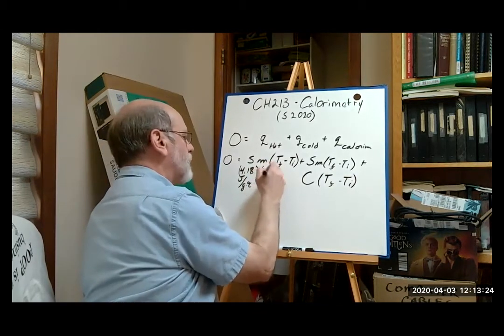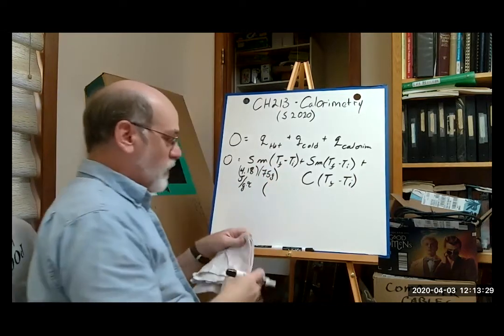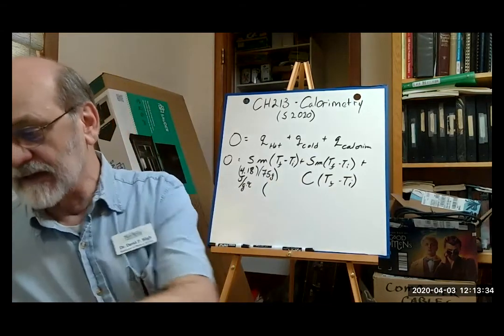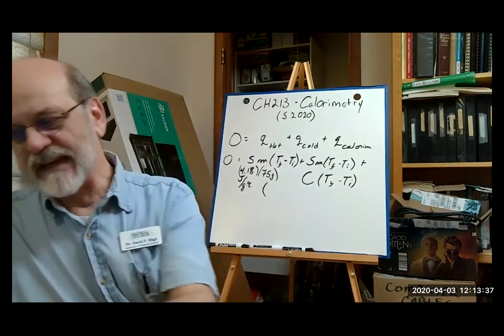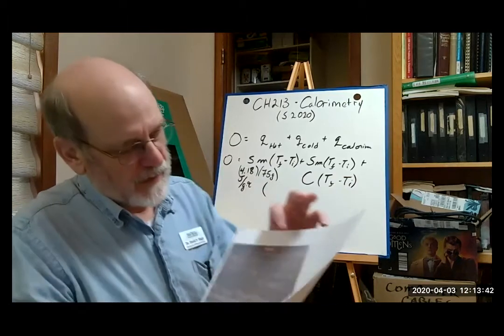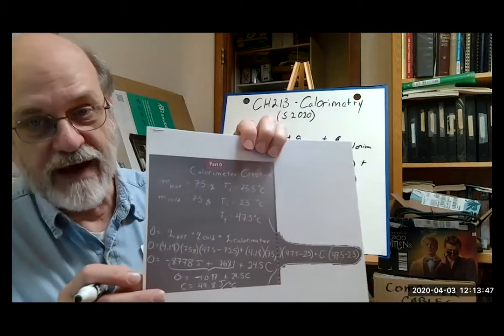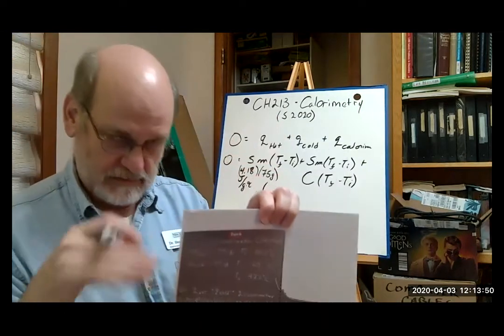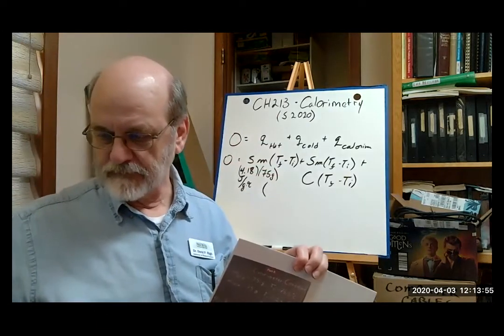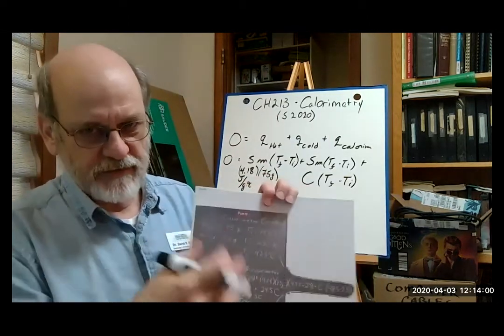75 grams. And then the temperature change, all right? So, whatever the temperature change happens to be, and the data that I'm going to give you will give you temperatures for the hot water and the cold water. And I'll just show it to you here. You'll have to print it out yourself from the Blackboard file, which was just below the document. We'll give you all this information.